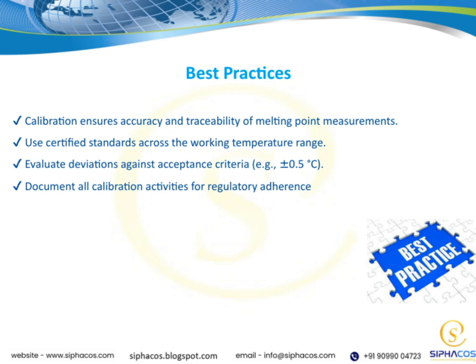And finally, don't forget to document all calibration activities thoroughly. Proper records are vital not only for internal quality assurance, but also to meet regulatory requirements. By following these best practices, we ensure our melting point measurements are precise, reliable, and compliant, supporting the overall integrity of our analytical processes.